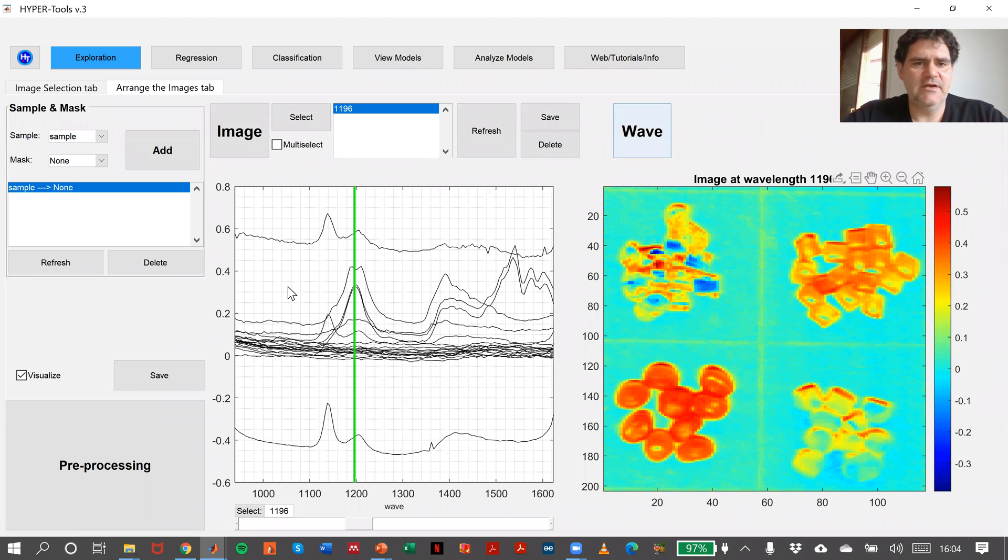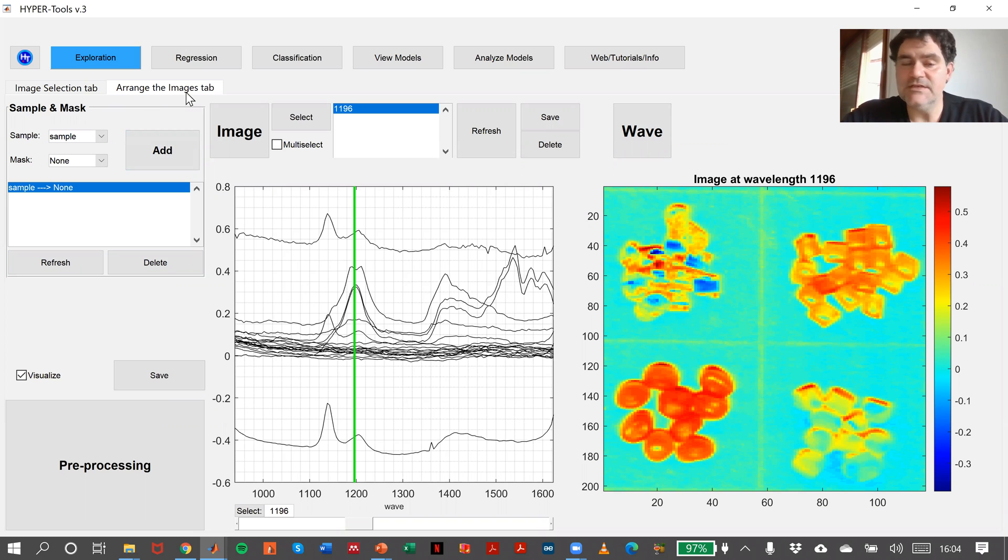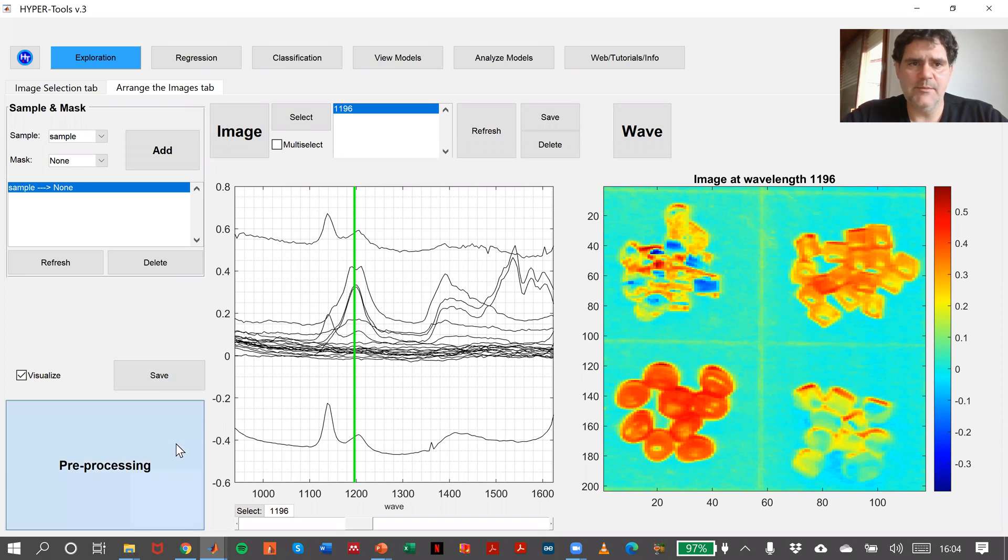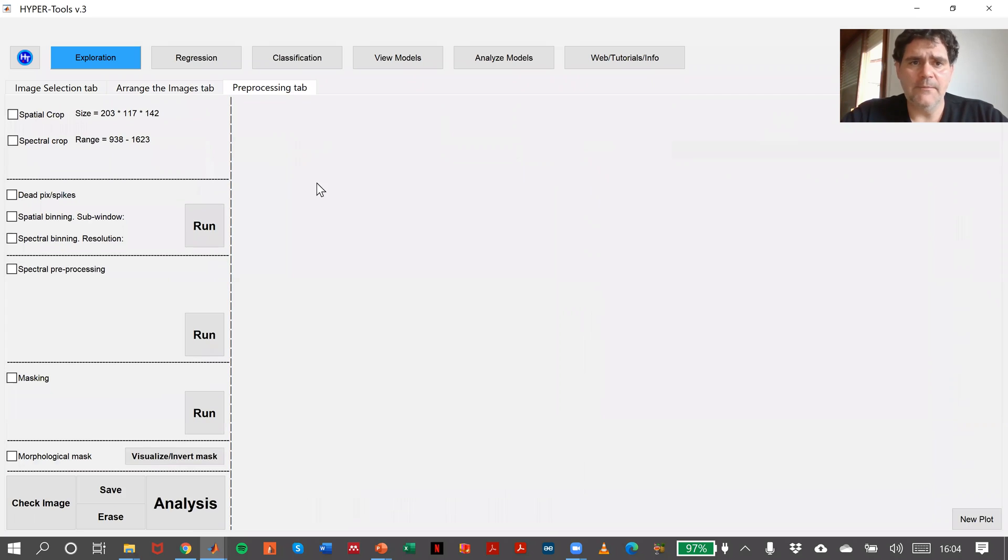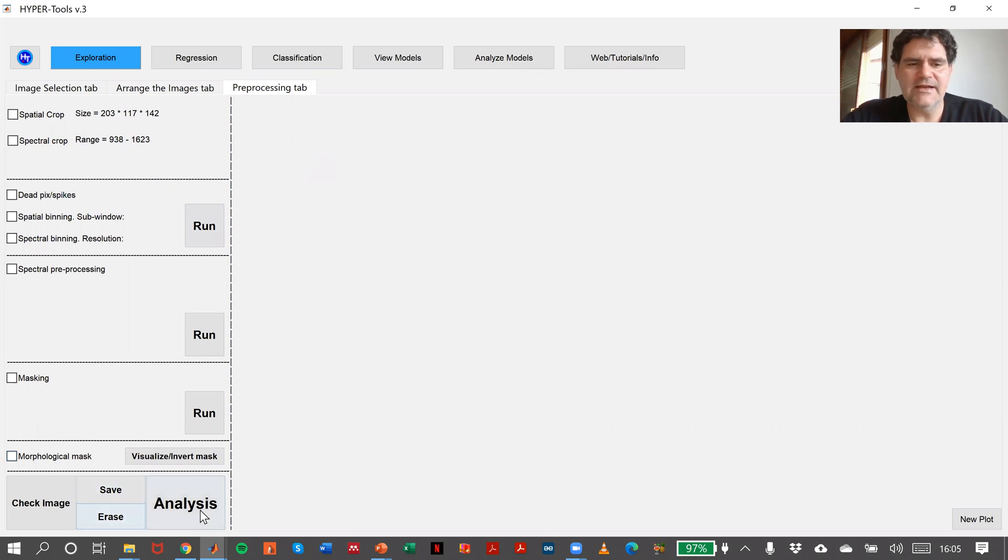Once we have made the arrangement that we needed, in this case it was easy because we only have one image, we can go to the preprocessing tab. If we don't need any type of preprocessing in our image, we can go directly to the analysis tab.